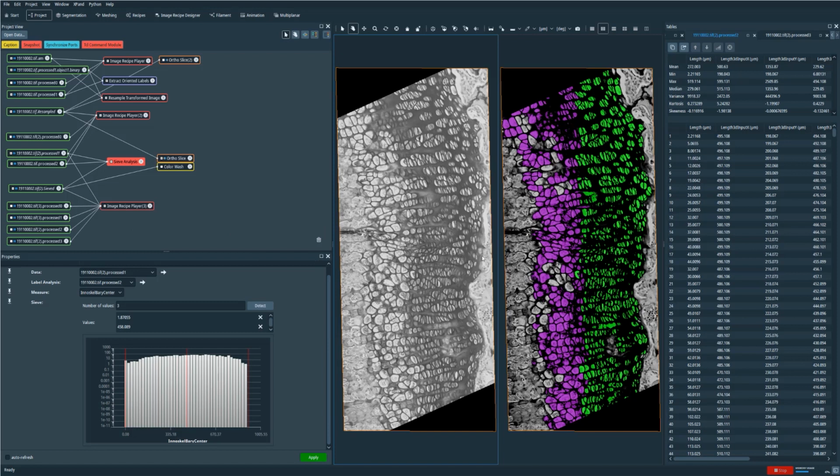The two images in the 3D viewer show the two kinds of cell population. So we have the grayscale image and also the label image. The hypertrophic cells are in magenta and the proliferative cells in green. Then the computational module called the sieve analysis allows us to easily separate the two cell populations. Quantitative data can also be extracted in Amira.